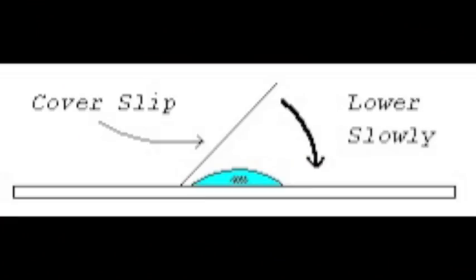There are five steps to make a wet mount slide. The first step is to place a drop of water on the slide, then place the specimen on the drop of water, take a cover slip, touch the edge of the cover slip to the slide and make contact with the water drop. Carefully ease the cover slip on top of the water.